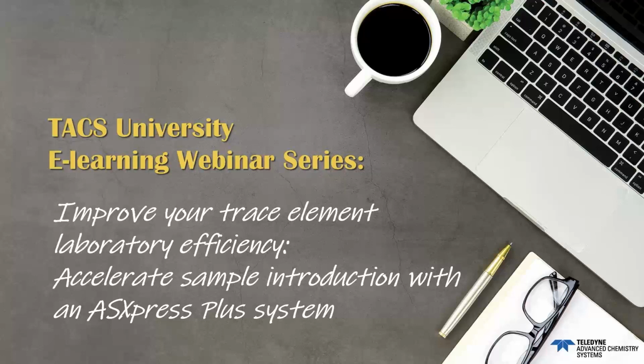Well, hello everybody. Thank you for attending today. My name is Pete Winship. I'm the EMEA Sales Manager for Teledyne CETAC Technologies. I'm an analytical chemist by training, and my background is in trace element analysis. Today I'm going to talk about improving efficiency in a trace element laboratory, but particularly with respect to accelerating sample introduction for ICP optical and ICP MS instrumentation.